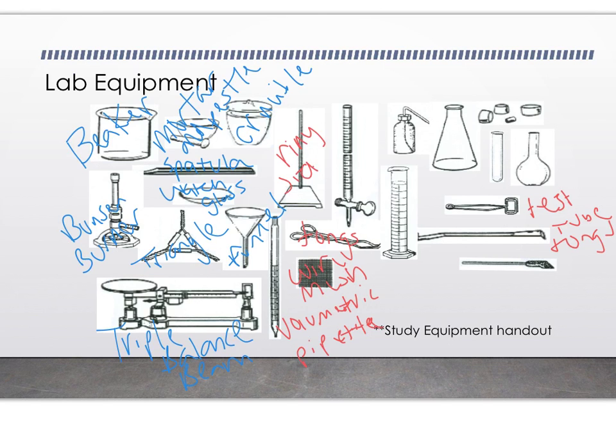Okay. Then you have your ring stand. A ring stand is used to support different types of equipment for the reaction. So you could have your Bunsen burner on the bottom, then you can have your triangle on top, and then the crucible sitting on top of the triangle, but it's used to hold different pieces of equipment vertically for a chemical reaction.